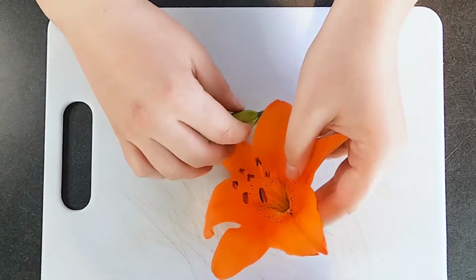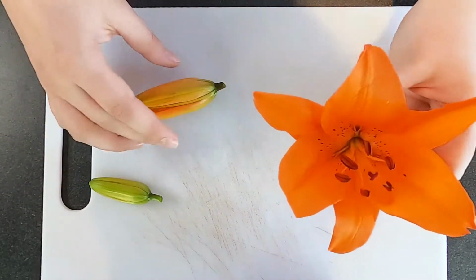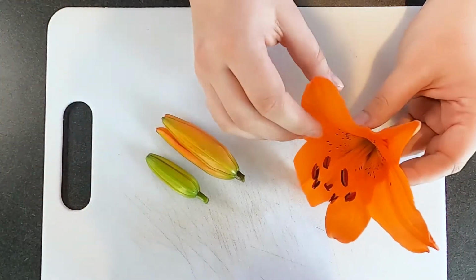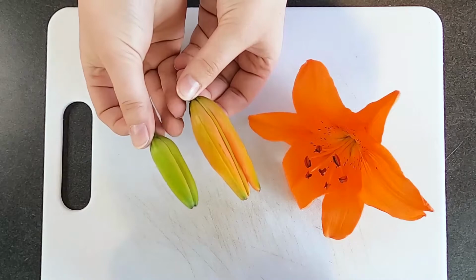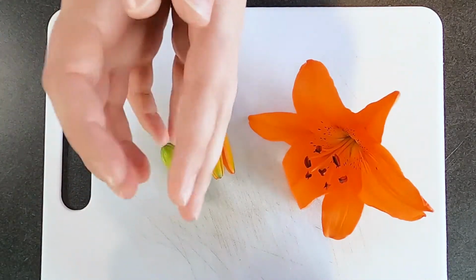So now we have this beautiful lily, this beautiful flower here. And we also have some closed ones here. So what we're going to talk about here is actually called the sepals and the petals. So the sepals you can see on the outside here are these nice green leafy looking petals that actually protect the bud on the inside.